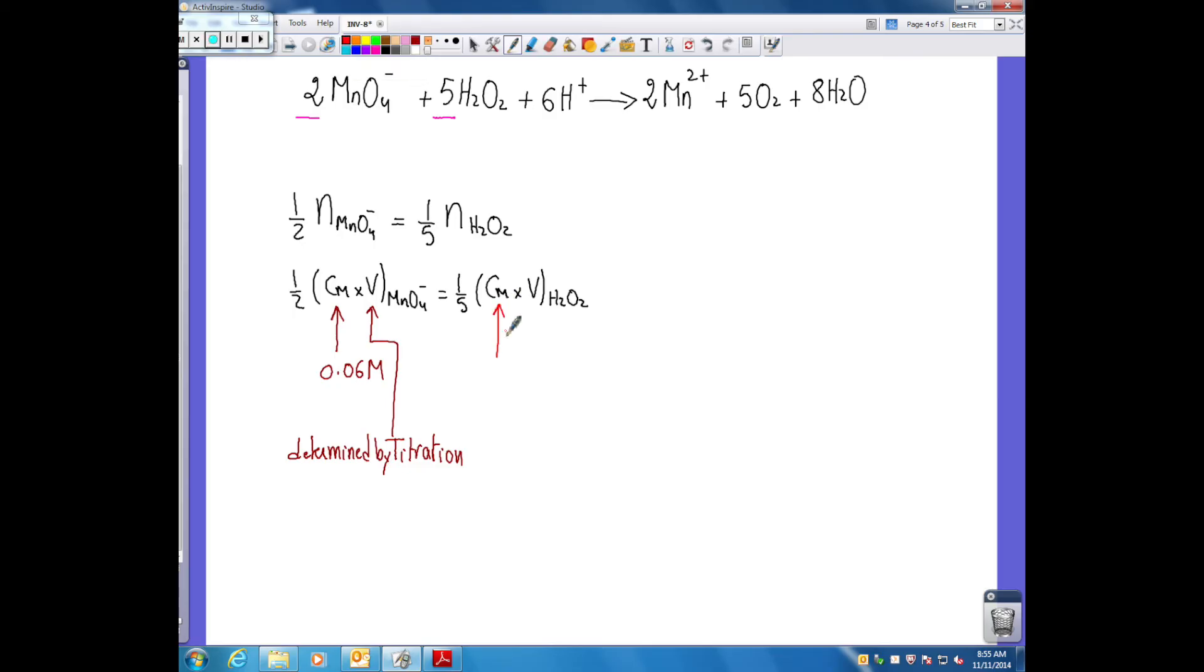The concentration of H2O2, this is what I'm looking for. This is the volume that I have chosen at the beginning of the reaction.